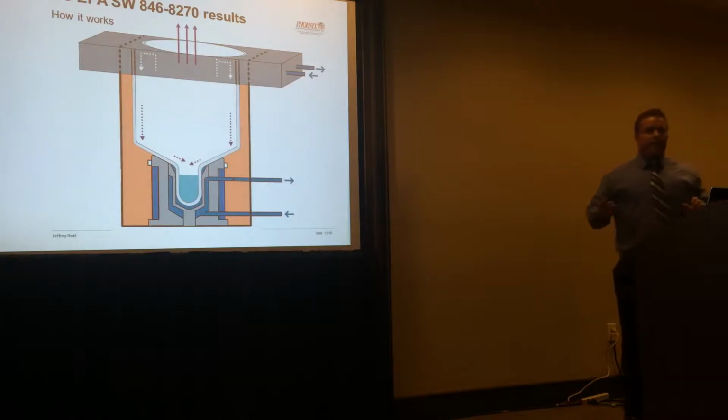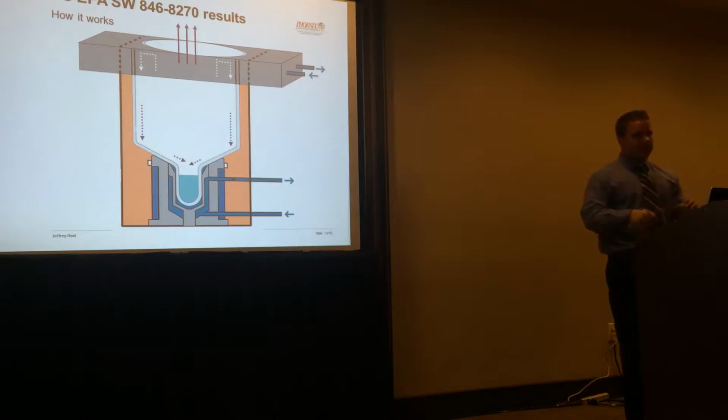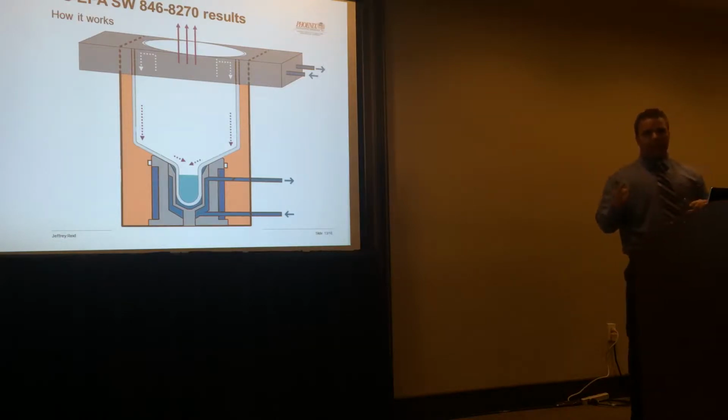So you think about that, yes, it decreases your throughput about 5–7%, but it still eliminates that step you have to take after the concentration process of rinsing down the glass wall. So you're saving solvent because you're not using additional solvent to actually rinse the glass wall.